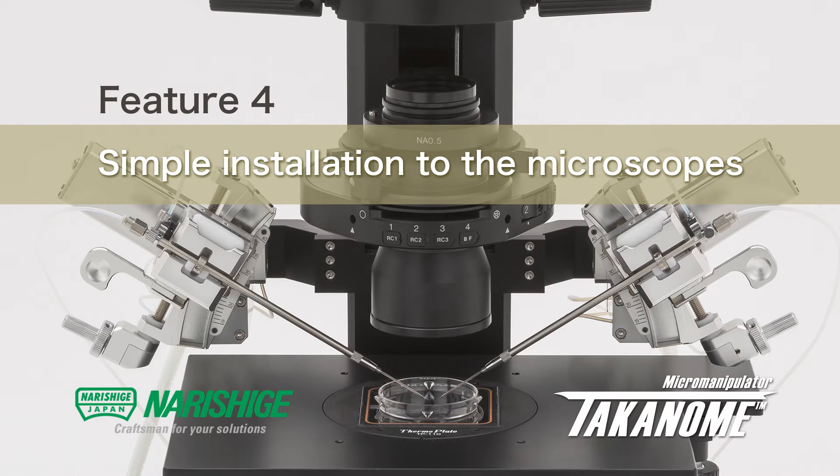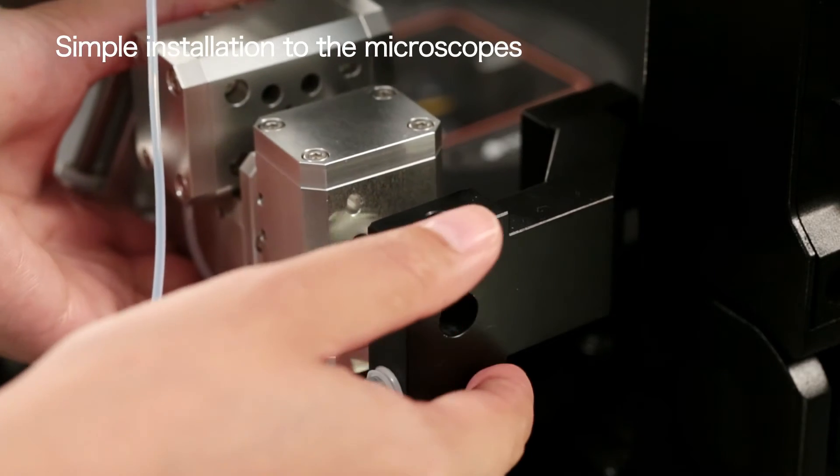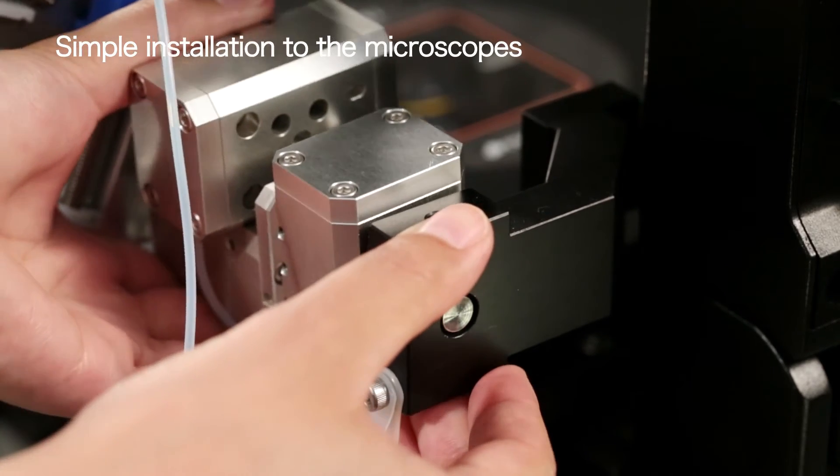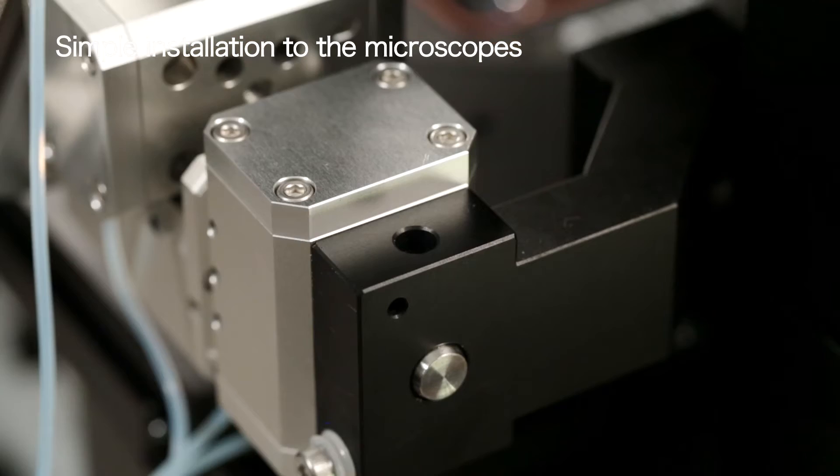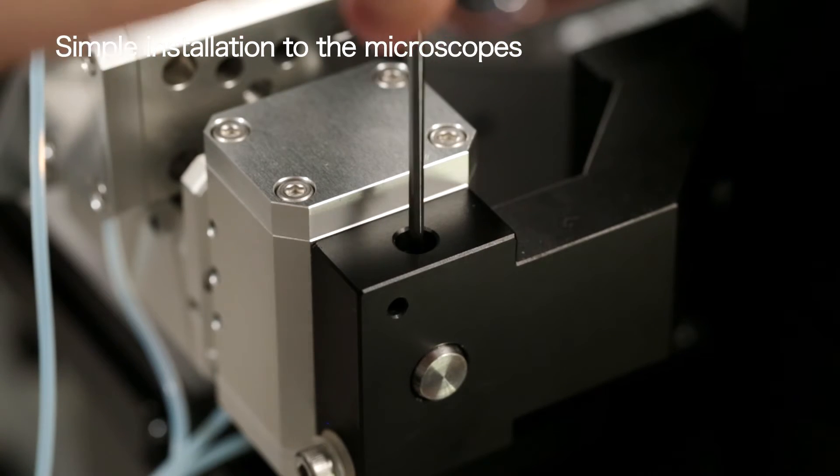Feature 4: radically simple installation in microscopes. No adjustment is required when attaching the mounting adapter and drive unit. With this, stability is significantly improved.